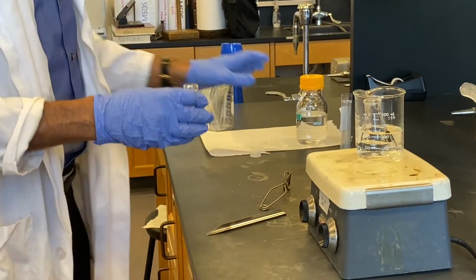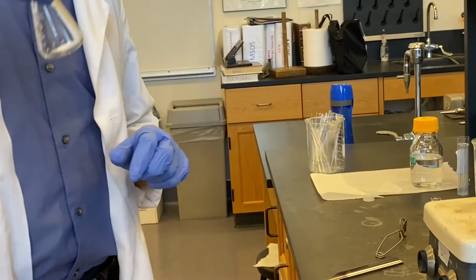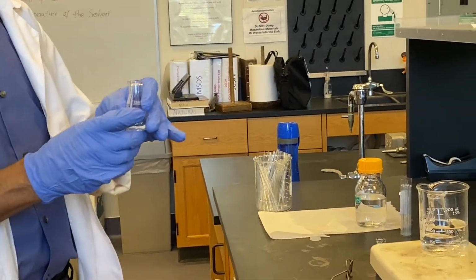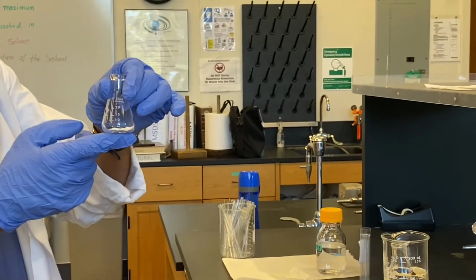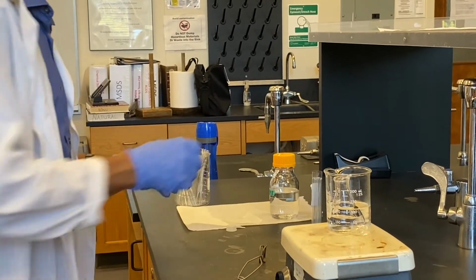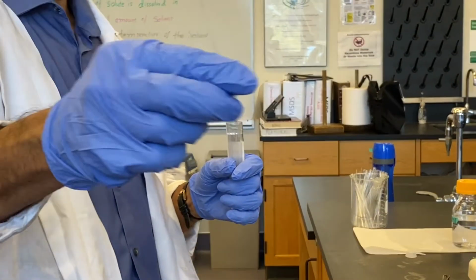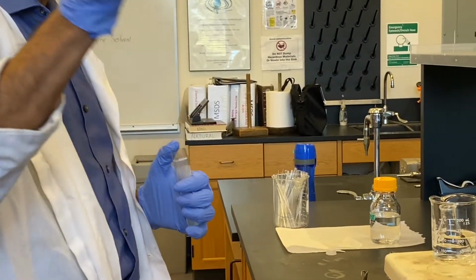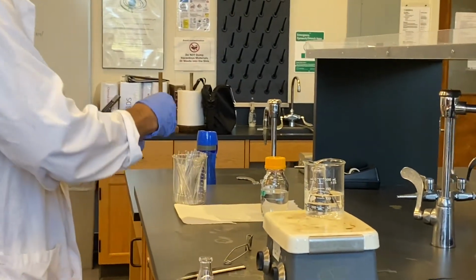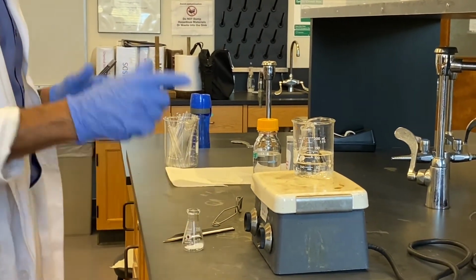And before this, because it's an impure compound, you better take a melting point of this compound. Okay, record the melting point. It's supposed to be about 10 degrees less than its reported melting point, since it's impure, right? So how do you take the melting point? We already showed that: you take a small capillary, this capillary, and then take the melting point in the melting point apparatus and all those things. You already know how to do it. So taking the melting point is the first thing because you need to know the difference.